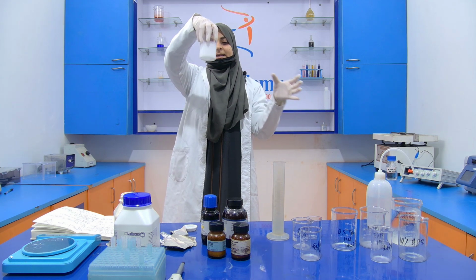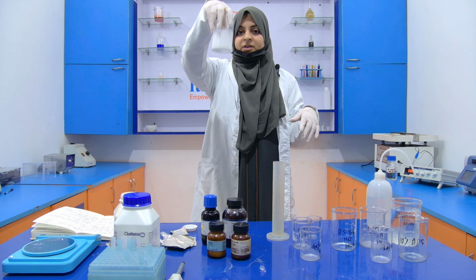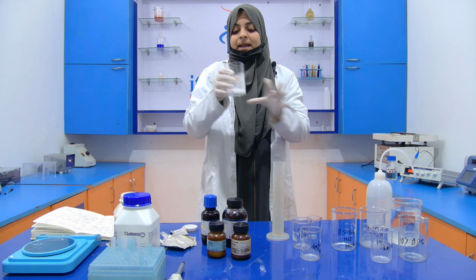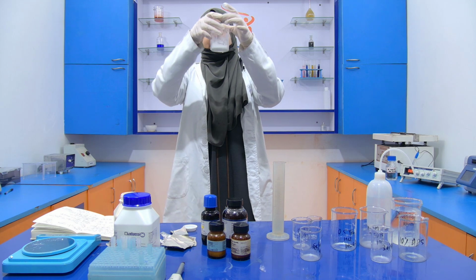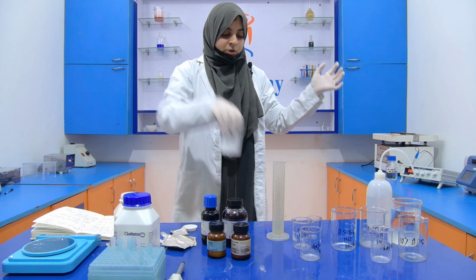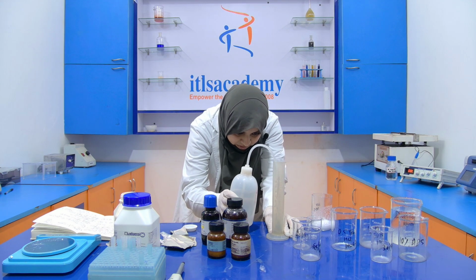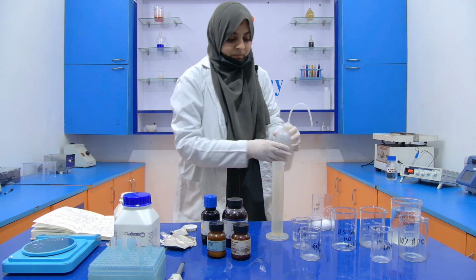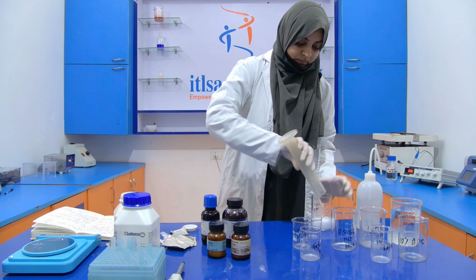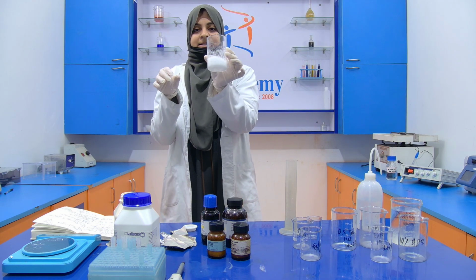Now, for 10% SDS, first you have to dissolve it into 25 ml of distilled water. Then, when it is completely dissolved, you have to add another 25 ml of distilled water. See, now it is completely dissolved. Now I am going to add more 25 ml of distilled water into it. Now 10% SDS is ready.